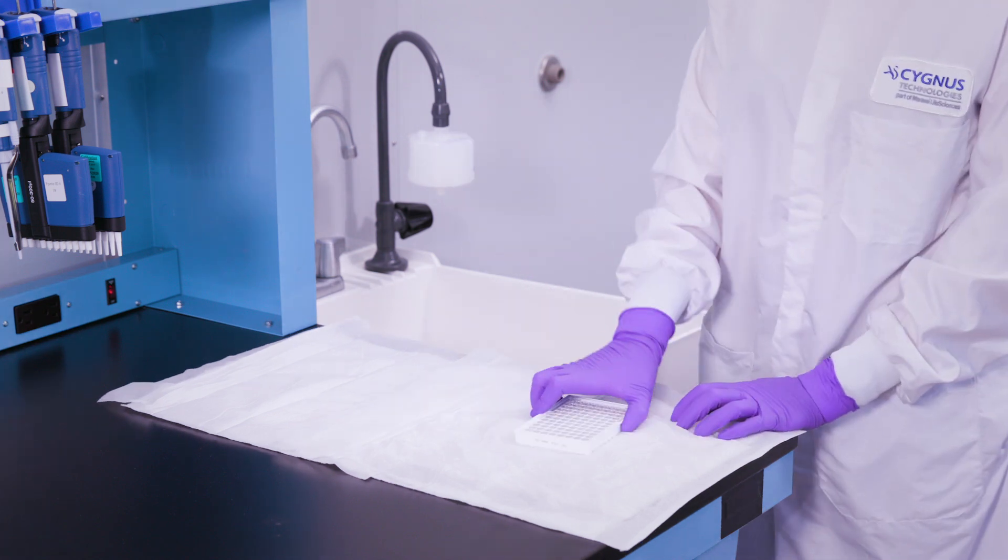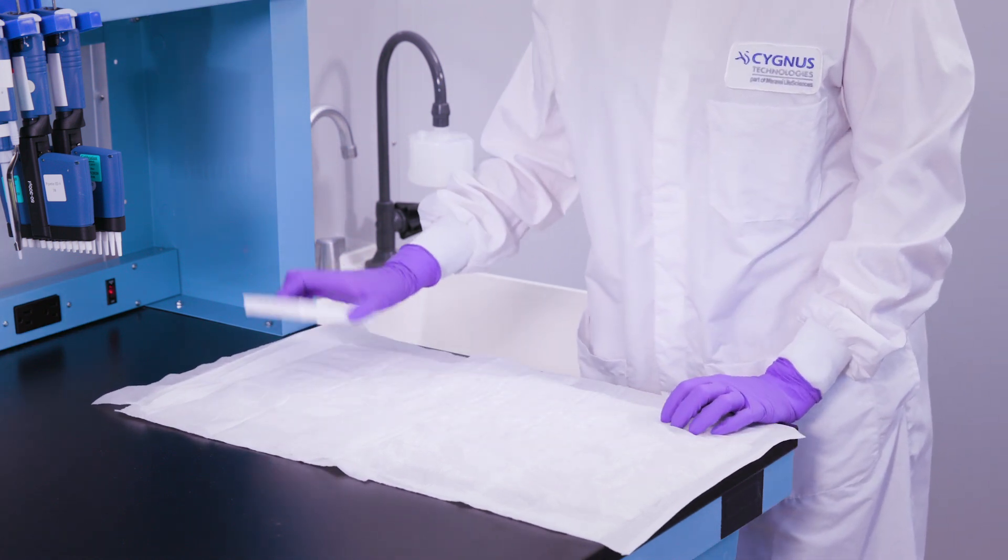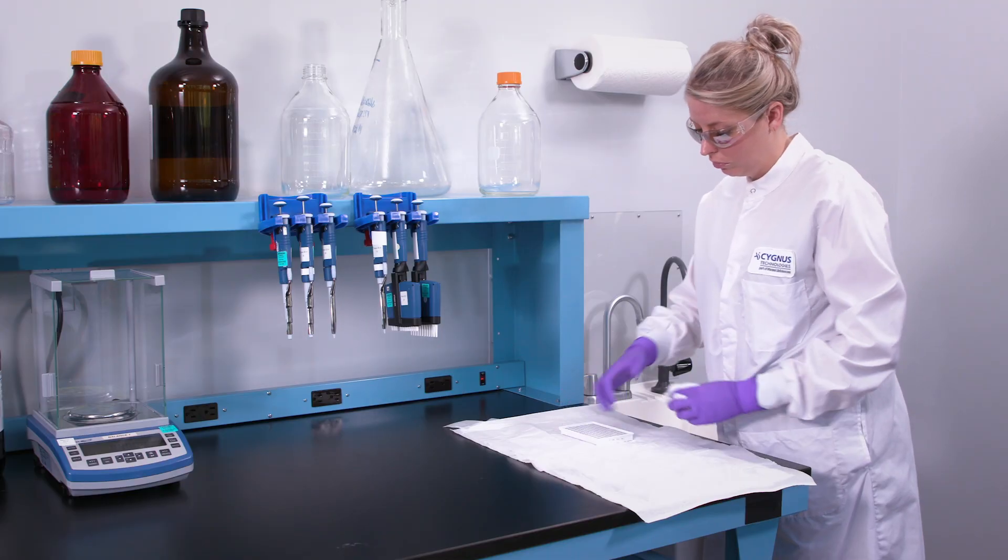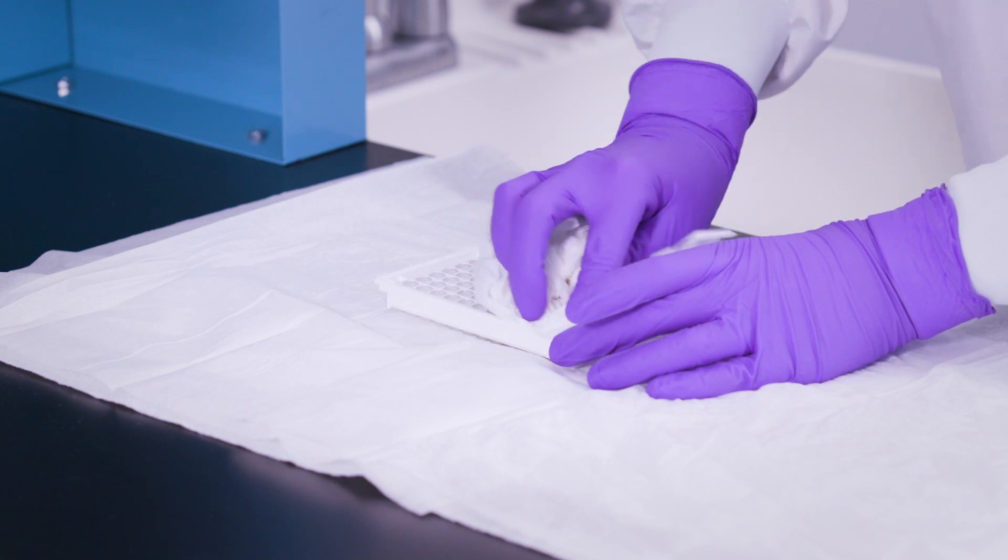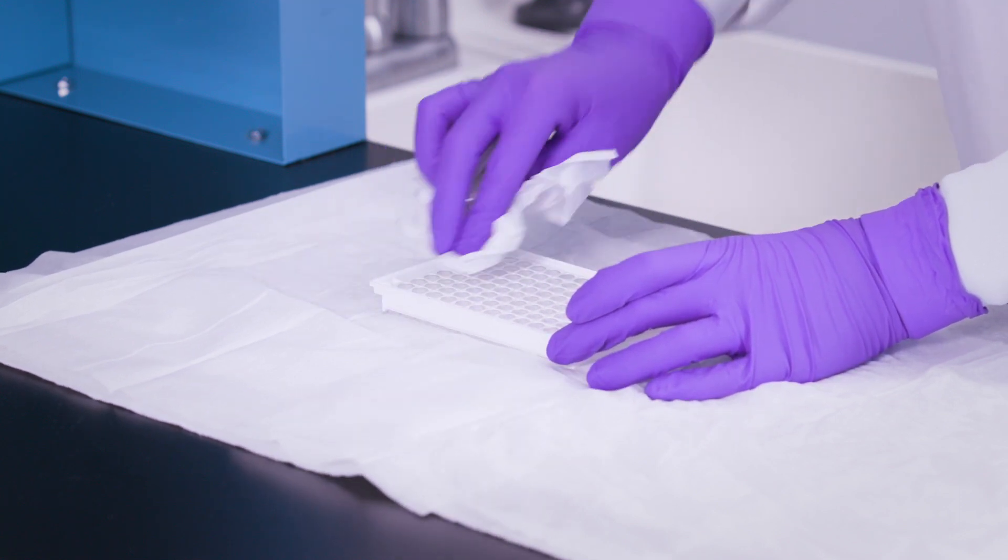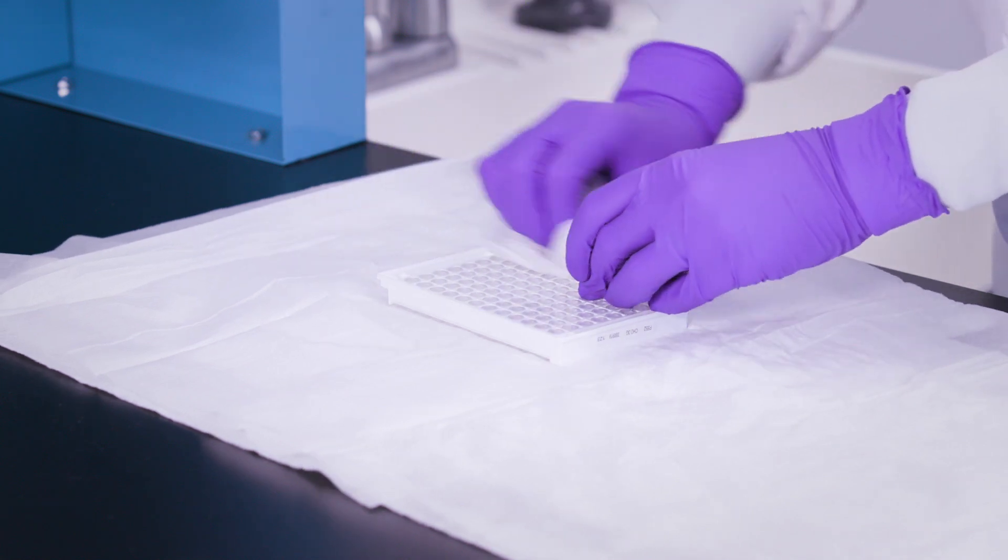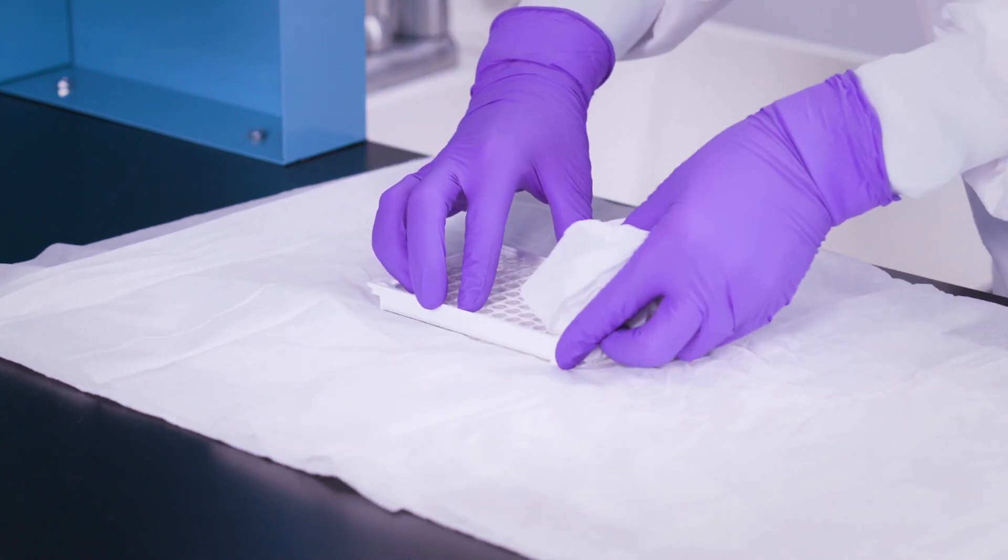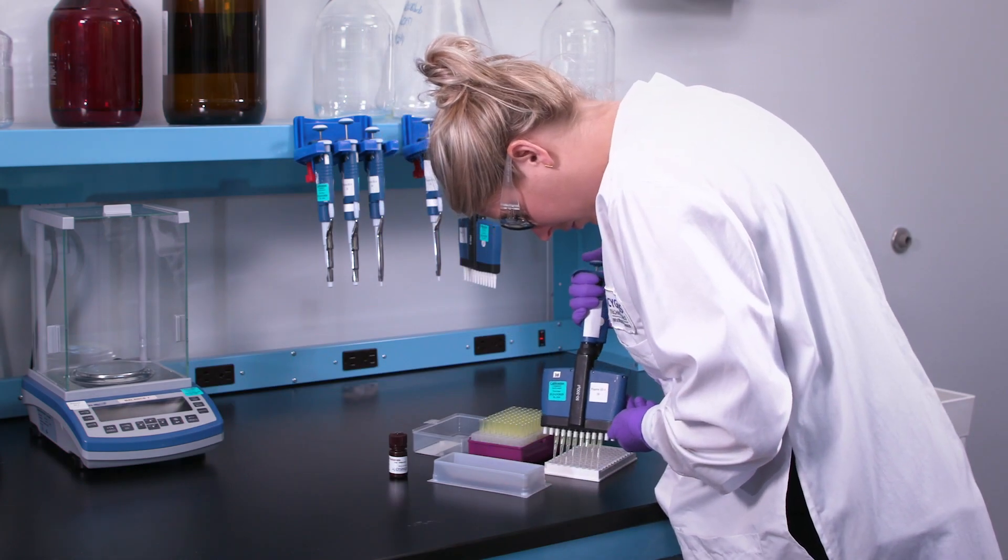After the final wash, blot and tap your plate eight to ten times on the unused sections of your blotting paper. When finished, wipe the bottom exterior of all wells with a clean absorbent paper. This will remove any remaining wash liquid caused by overfilling and tapping the plate. Once this is completed, the wells are now ready for substrate to be added to them.